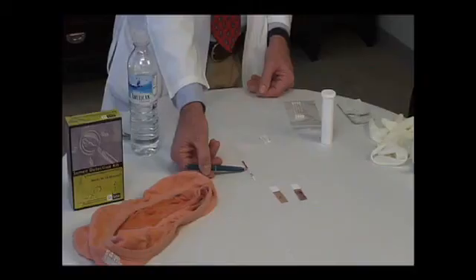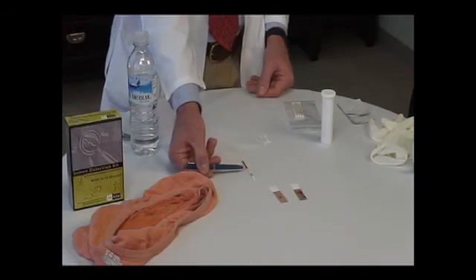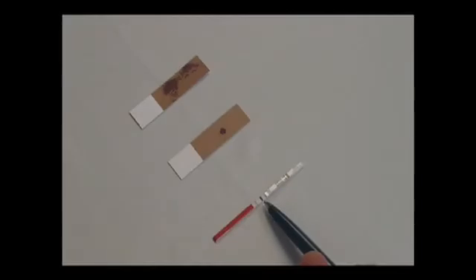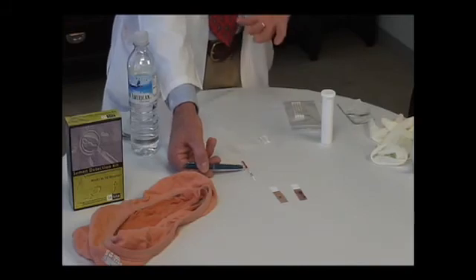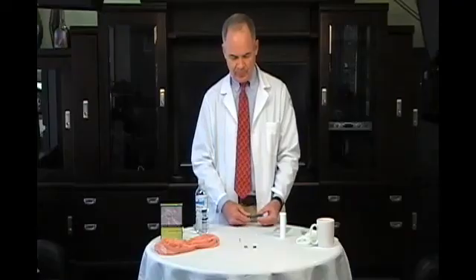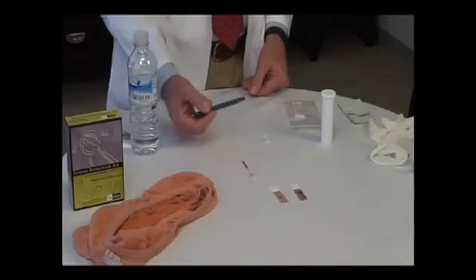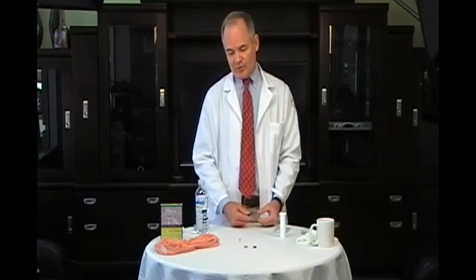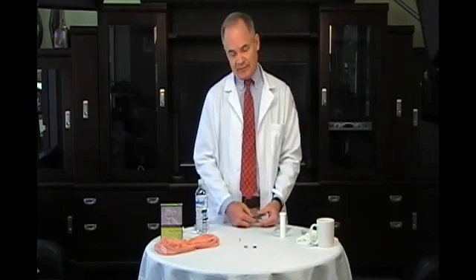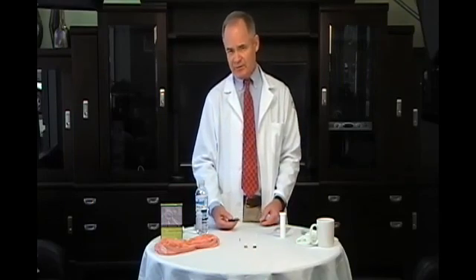If the test region is less intense than the control region, then there's less than a 100% probability that this is PSA. According to the literature, if you can just barely see the test line, there's a 90% probability that what you're looking at is PSA and therefore semen. In case of a weak test, where you have a weak PSA test and a weak acid phosphatase test, the combination of both tests used together gives the investigator a more certain conclusion that what he's looking at is semen than either test taken by itself. And that's one reason why we include two kinds of test strips in this kit.